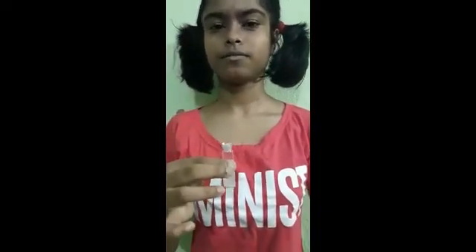Now we will add yeast powder in it. After mixing it, we will smell it, but it doesn't smell at all. Now we will plug it with cotton. This will prevent oxygen from mixing with the solution, and we will leave it for 3 to 4 hours.